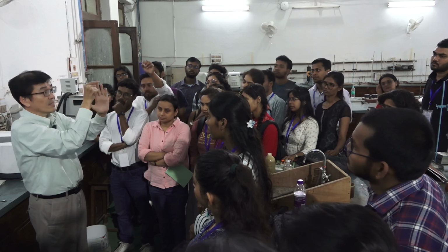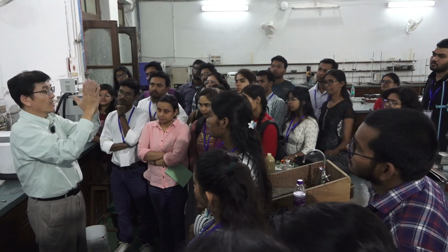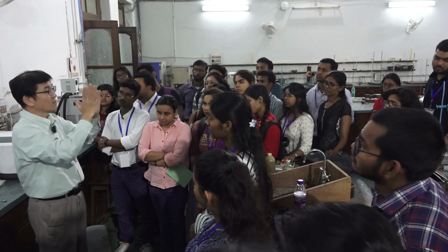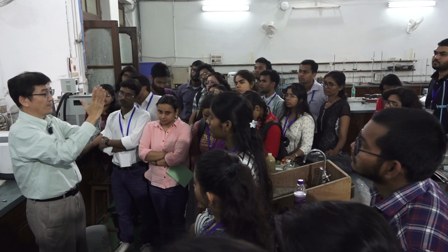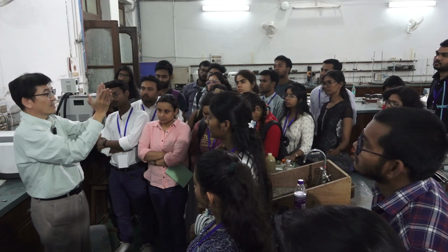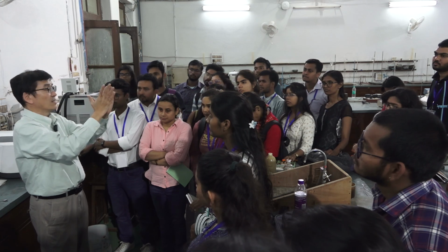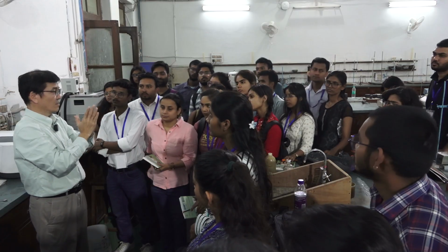Here is a liquid film flanked by two windows, and it's very difficult to control this length exactly the same. If there is one dust, it changes a little bit. If the volume of the liquid sample is too large, the windows cannot approach. So it's difficult.